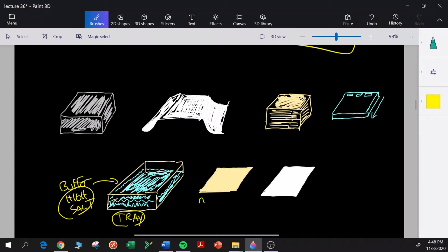So this is going to be our nylon membrane. This right here is going to be some blotting paper, which is just like a really thick paper. It doesn't tear easily when it's wet, and it's really absorbent. And here we have a bigger sheet of blotting paper.